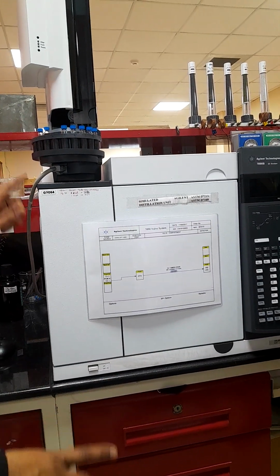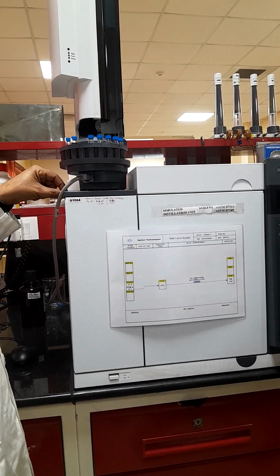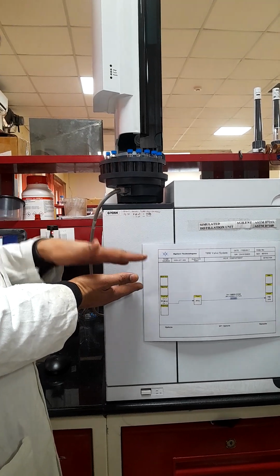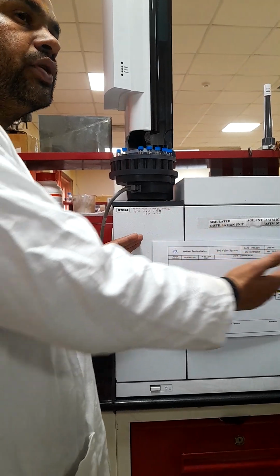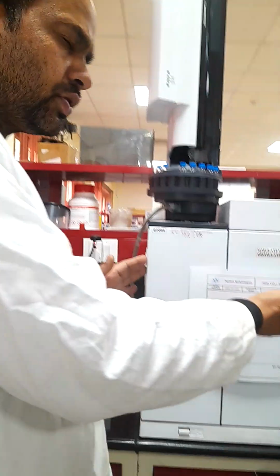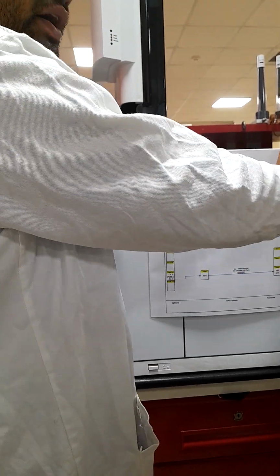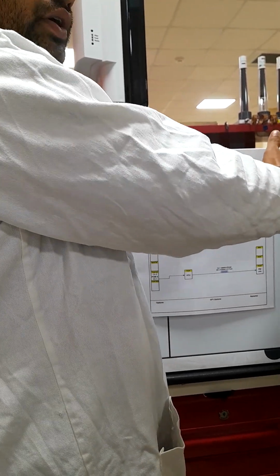Due to these temperature gradients, when your sample is in liquid phase and gets injected at your inlet point, it will get vaporized. So vapors will form. Then it will get a lower temperature, and it will stabilize there. After that, due to the flow of gas, it will slowly move to the column. And due to the PDMS or the polarity of your column matrix, every component of your sample will get separated out. Similarly, there is a high temperature, so the tendency of gaseous molecules is to reach there and get detected.